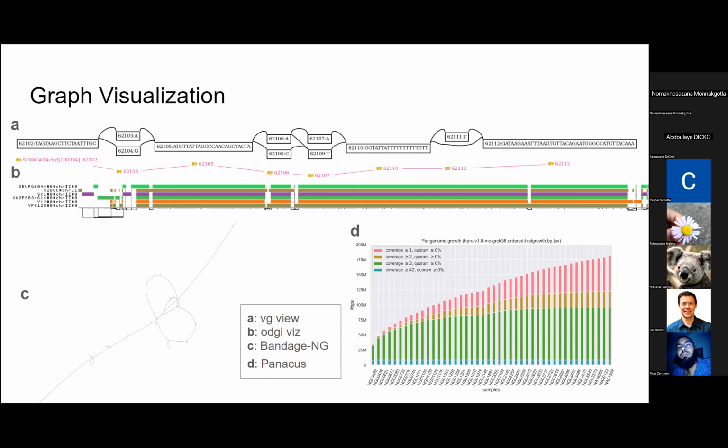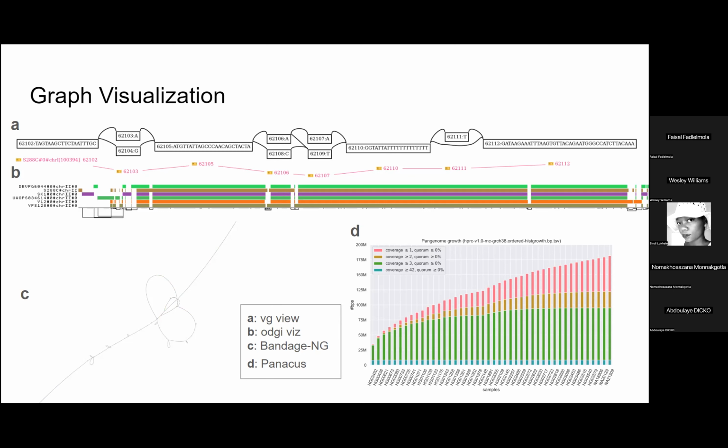So for people working with pangenomes, and this will come up in the workshop, I definitely encourage you to use these as much as possible to get a feel for what variants look like in your graph. Next slide.